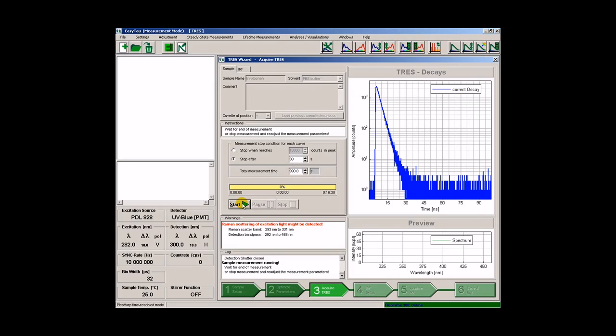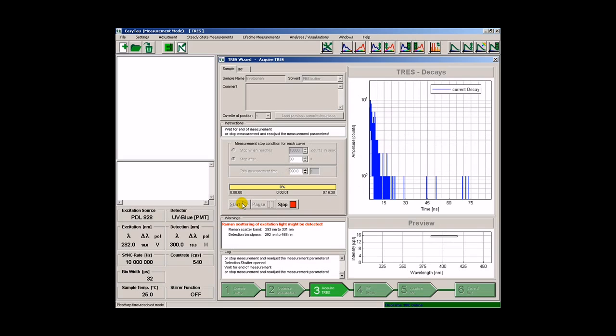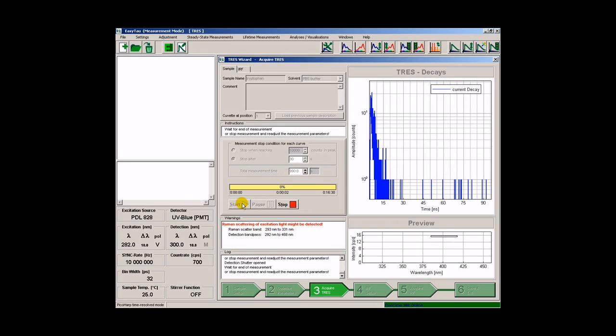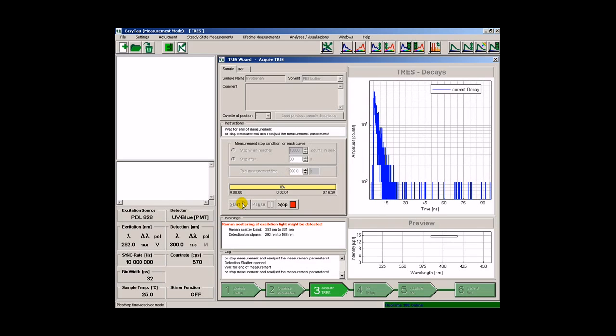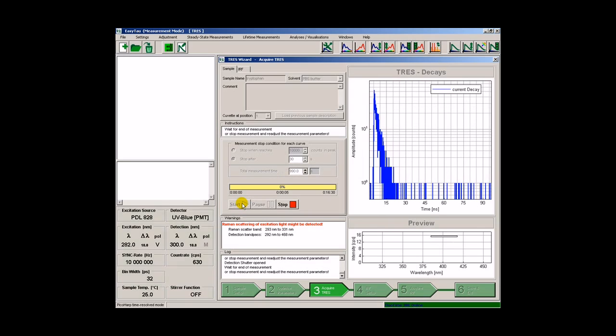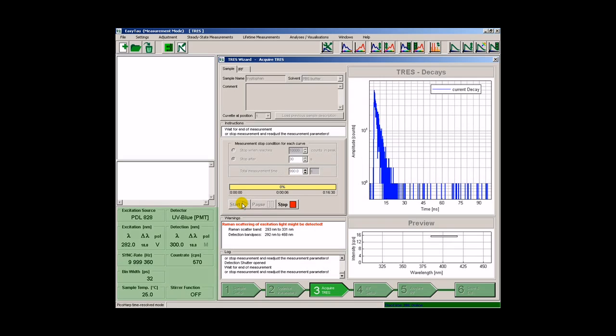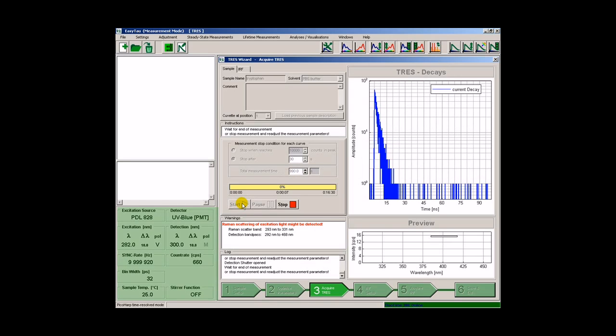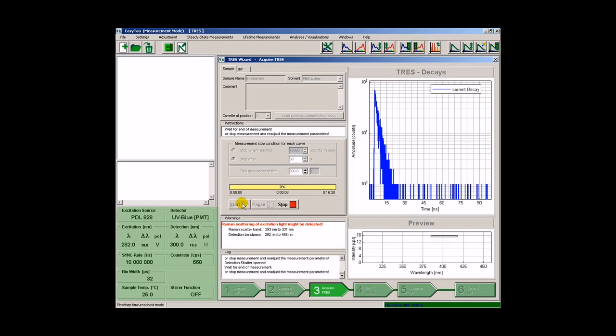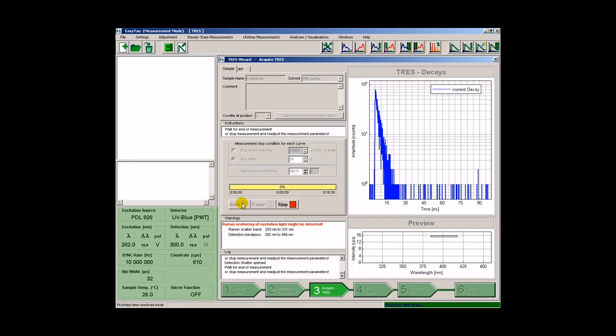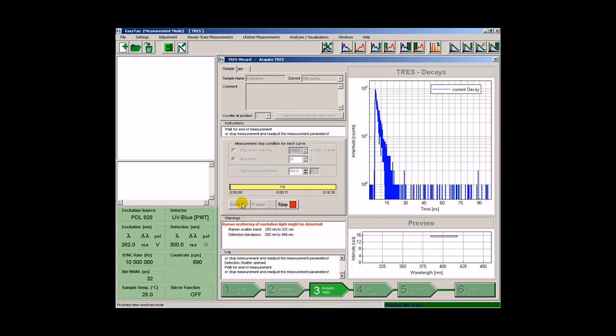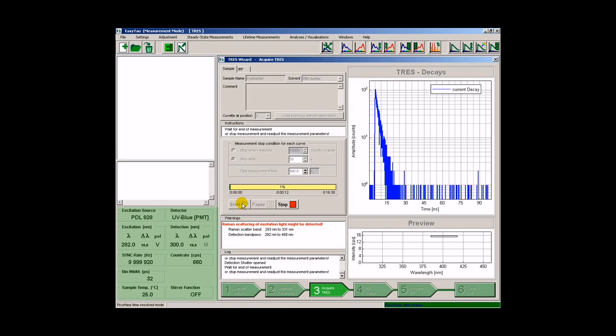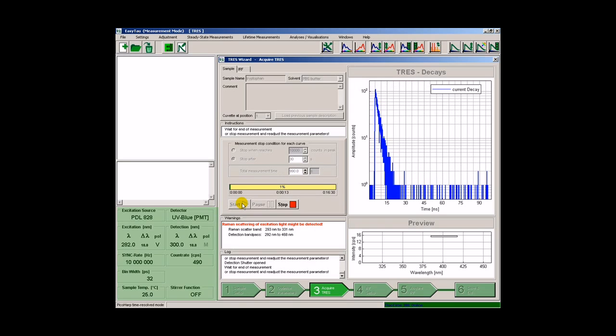Now the wizard records decay histograms for the wavelength range that we have selected. We can monitor the progress of the experiment via the display here on the left, showing the momentary measuring conditions as the wavelength at this time.